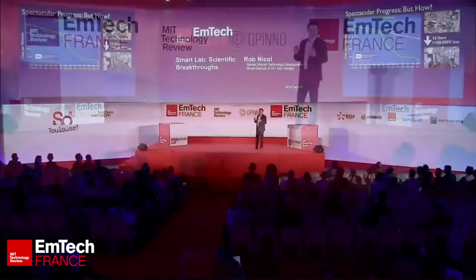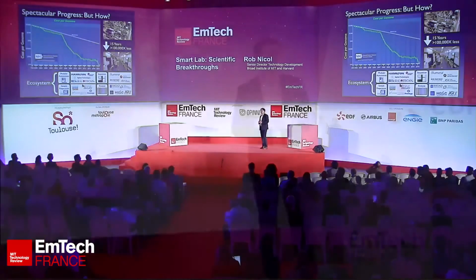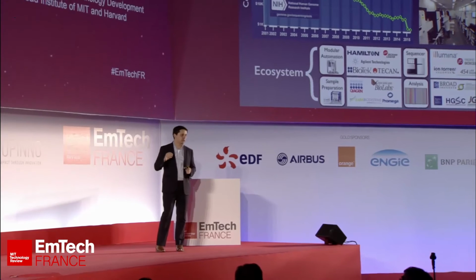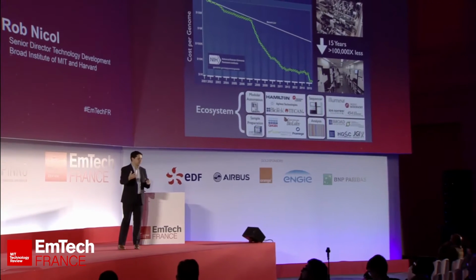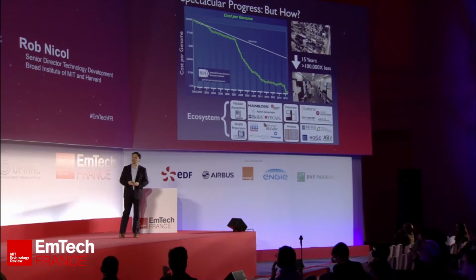And that's amazing, right? I mean, not even semiconductors have actually progressed at that rate. But it was enabled by this ecosystem. So our lab, we try to keep it at the leading edge, but it's really powered by this large ecosystem between companies that make the reagents, the sequencing companies, sample preparation. So as one bottleneck, for example, in reading the DNA was broken, the bottleneck might go to sample preparation, so actually taking the cells out of a patient, processing them so that they'd be on a sequencer.